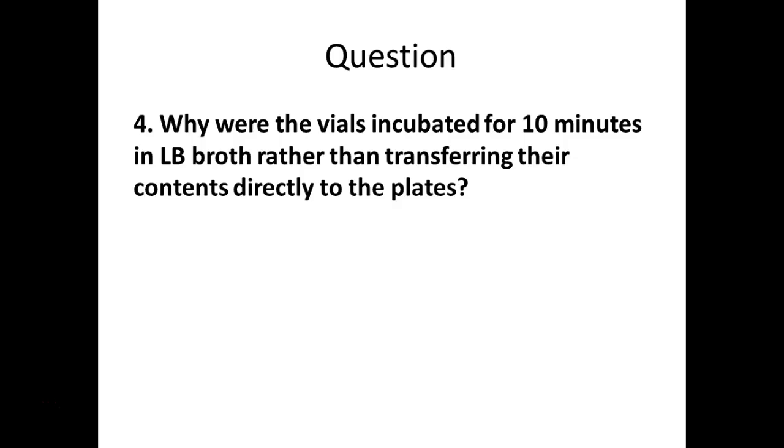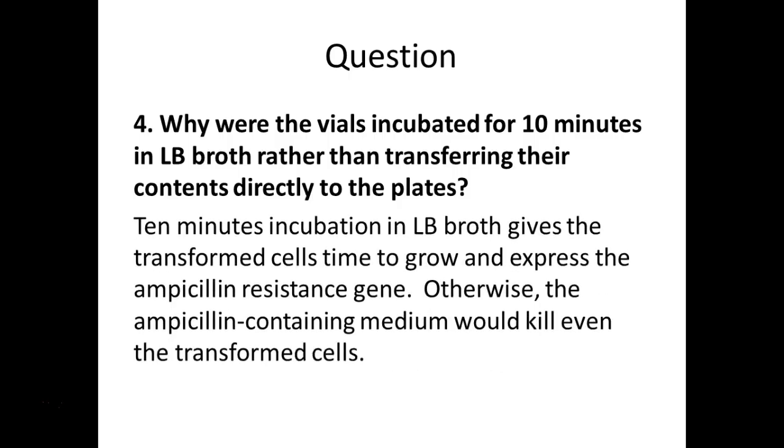The ones that didn't take in the DNA, are they going to be able to survive on these plates? No, they're going to be killed, right? So the 10 minutes is to give them the time to make the beta-lactamase enzyme, that enzyme to destroy ampicillin so it won't kill them.